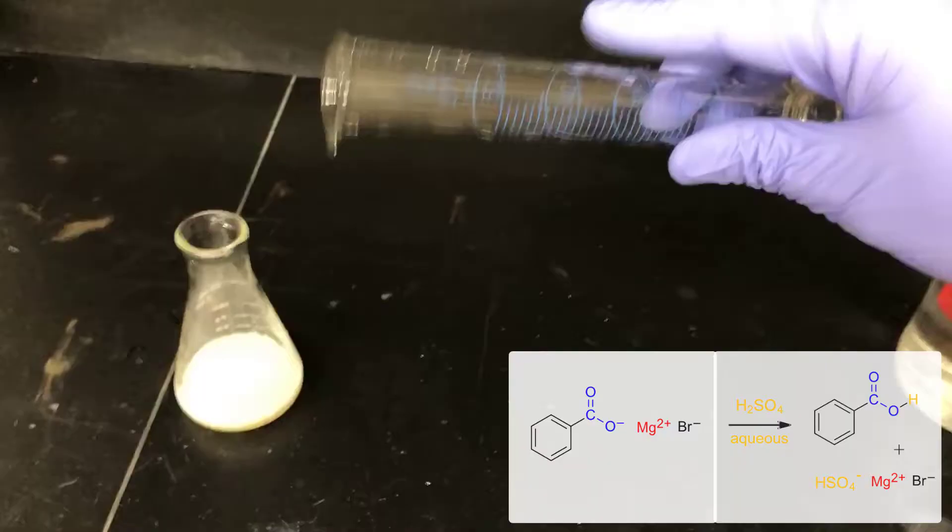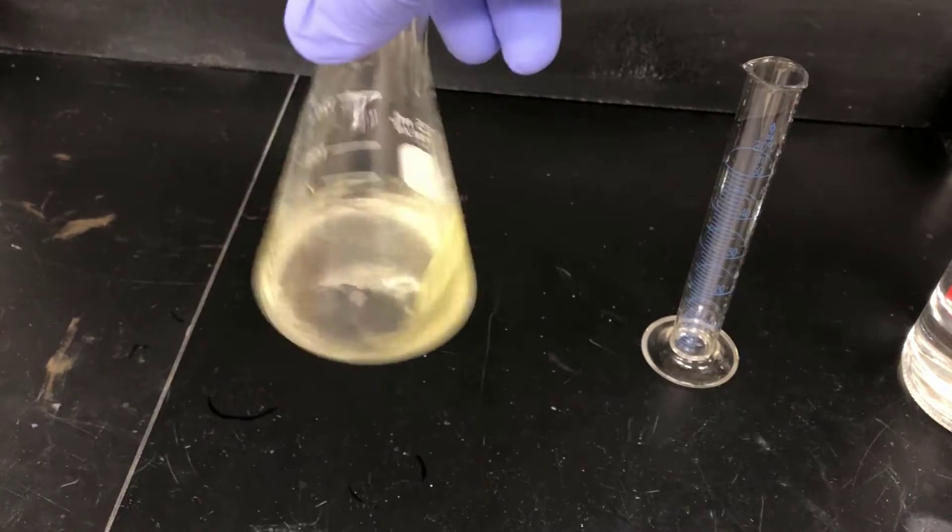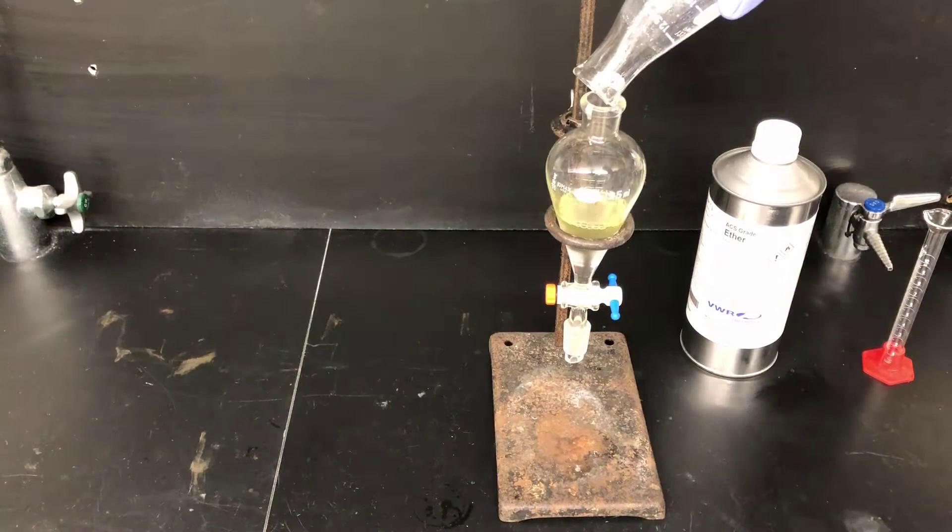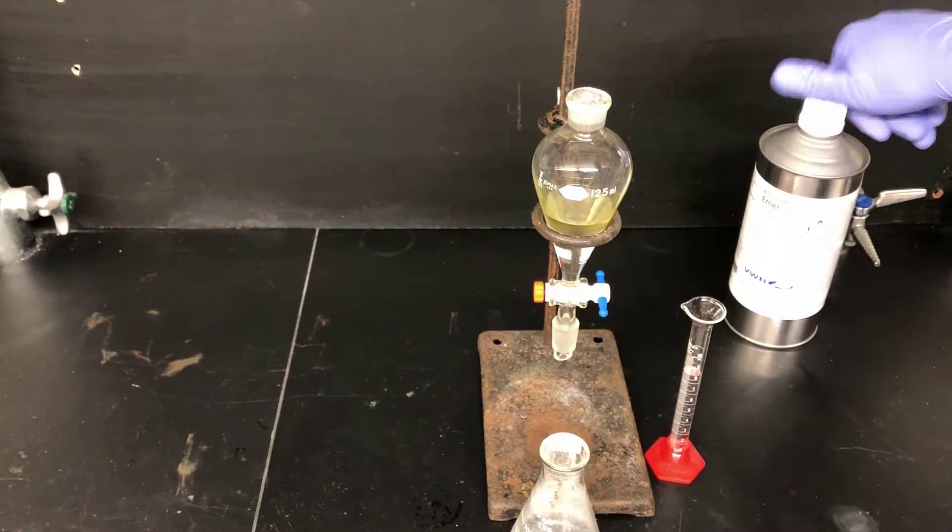It starts off as a milky-white mixture, but as I swirl it, that'll give way to two clear phases, an organic phase and a water phase. Now I'll pour that two-phase mixture into a separatory funnel so I can separate those layers. There's a lot of white residue on this Erlenmeyer flask. That's actually benzoic acid product, and to try to recover that, I'm going to rinse this flask with some ether. I'll measure out 8 milliliters of ether, then I'll use that ether to rinse the Erlenmeyer flask in two portions.